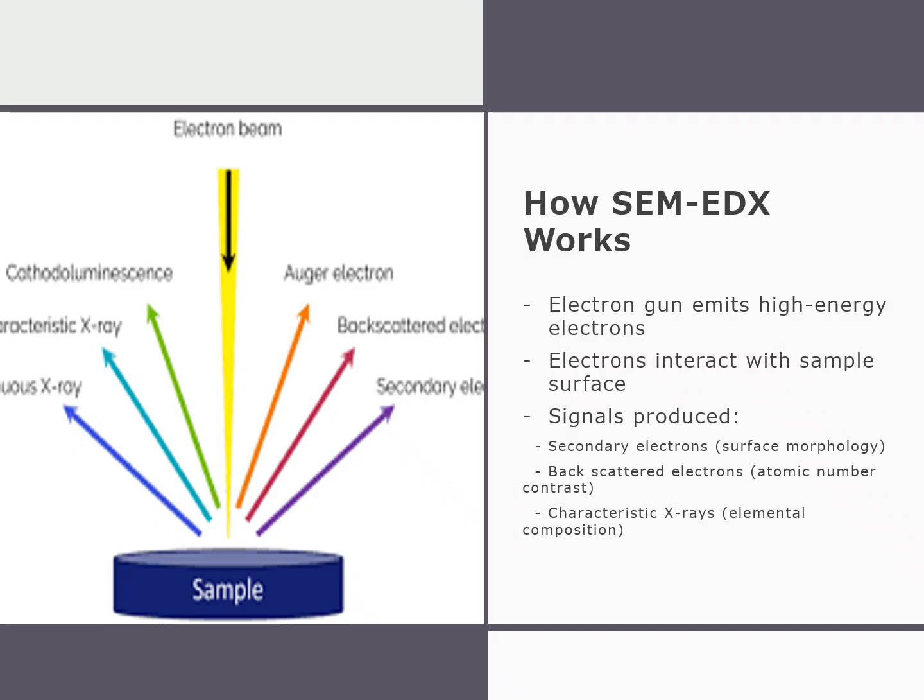Because of this, SEM-EDX is considered a powerful technique in forensic science, particularly when a visual match alone is not enough to confidently classify evidence.